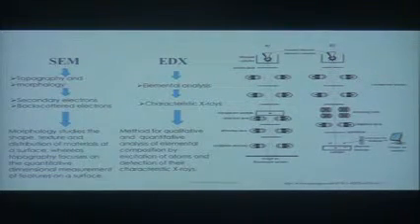I may have an occasion later this week to show you an example of EDX where we've made some nanostructures, and we did it in a synthetic way that was not highly controlled, and so we wanted to know where the elements ended up. We made basically a soup, and we cooked the soup, and we weren't sure what was left at the end. Well, EDX is a way to give you that kind of information.